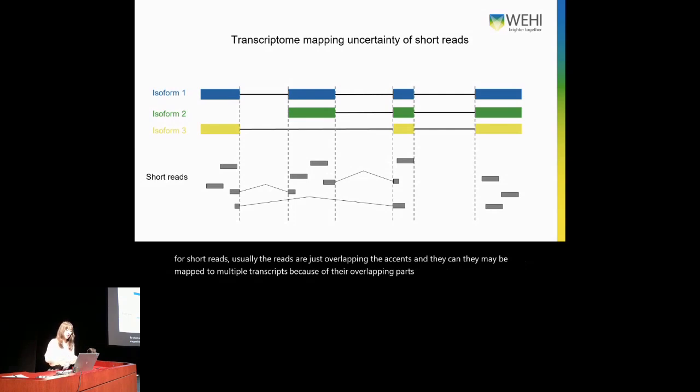So for transcriptome mapping using short-read technology, there may be some mapping uncertainty, which may increase the technical noise of this kind of quantification method.